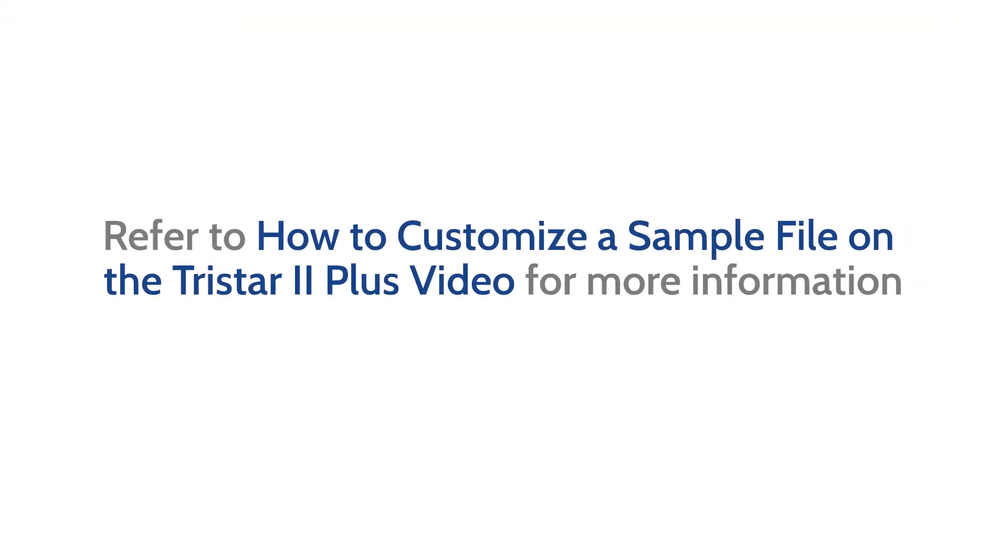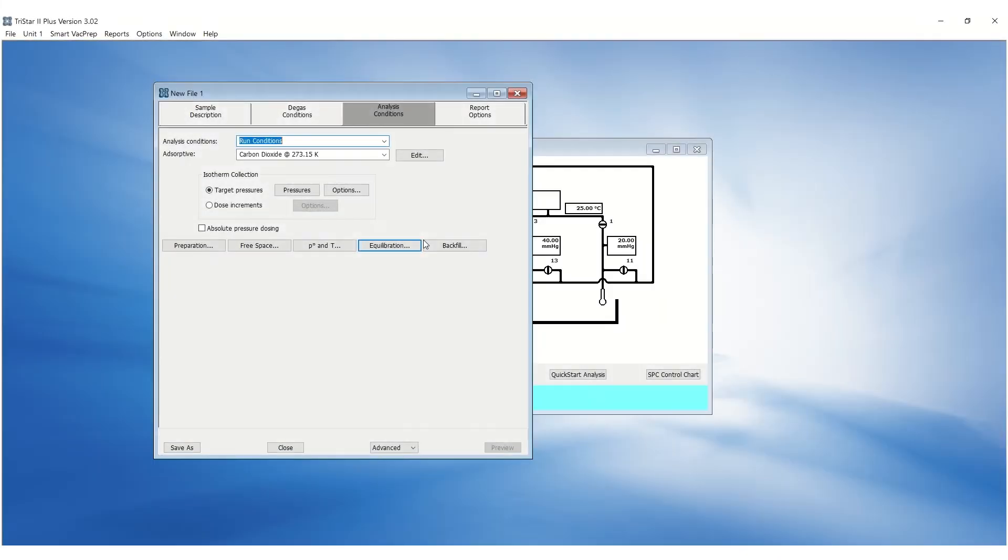To learn how to customize these parameters, please refer to the How to Customize a Sample file on the TriStar 2 Plus video for more information.